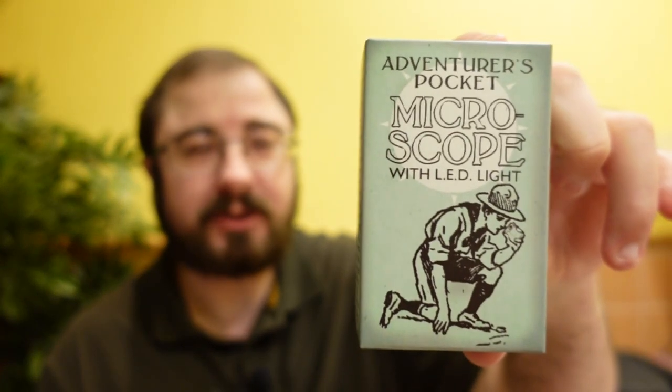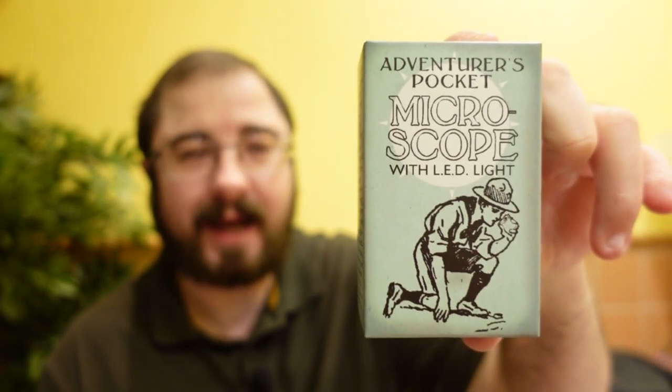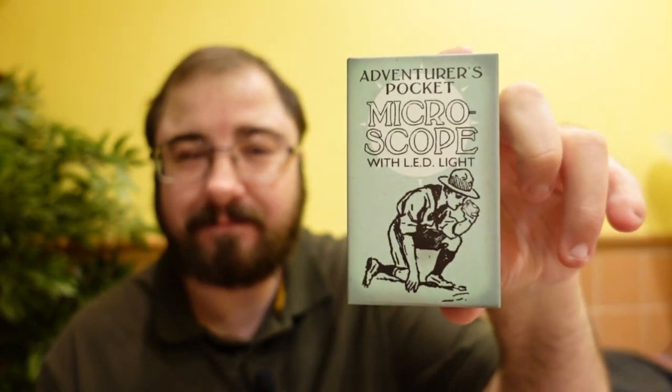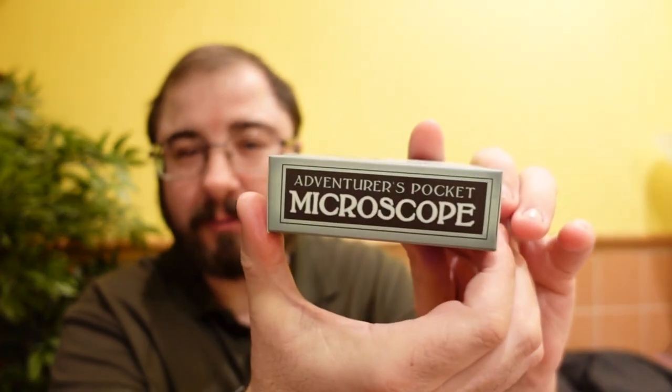Hello there! Today I thought we would have a look at something I found. I wasn't sure at first, but I thought it was a really good idea. I picked this up because it just looked so fun and a little bit retro. Today we're going to have a look at the Adventurer's Pocket Microscope with LED and leatherette case. Look at this — it looks like something from the 1950s. It's brilliant, such a great idea. There we go, little microscope.